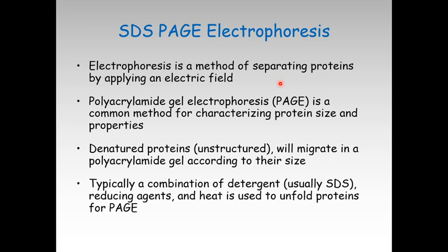However, as an analytical method, SDS gel electrophoresis is extremely important. One of the advantages is that proteins can be visualized as well as separated, permitting us to estimate quickly the number of different proteins in a mixture or the degree of purity of a particular protein preparation. Now, SDS electrophoresis uses a polyacrylamide gel, and hence the name polyacrylamide gel electrophoresis.